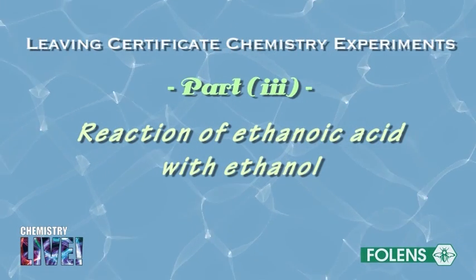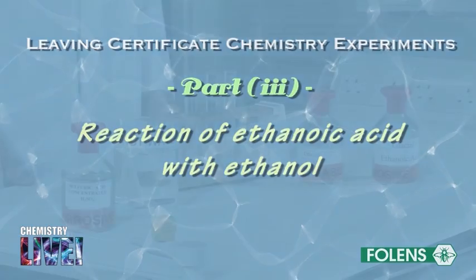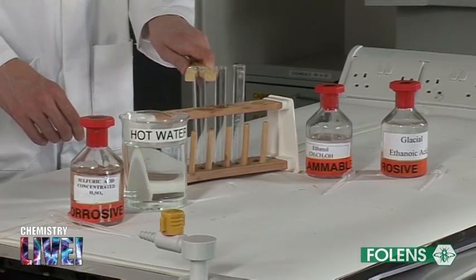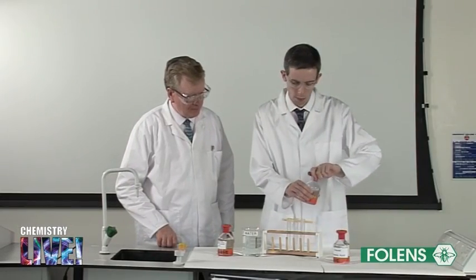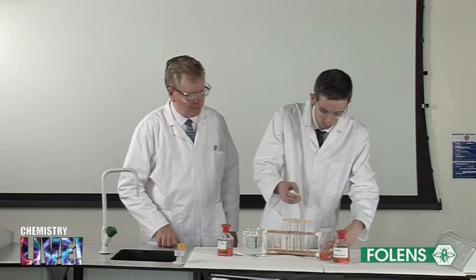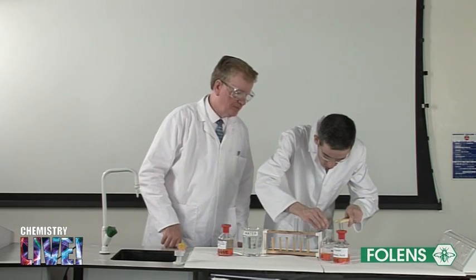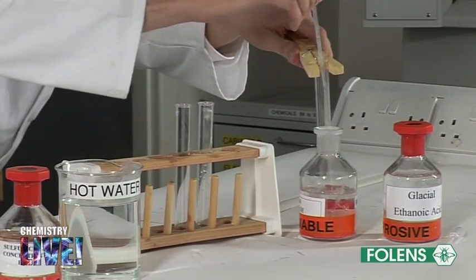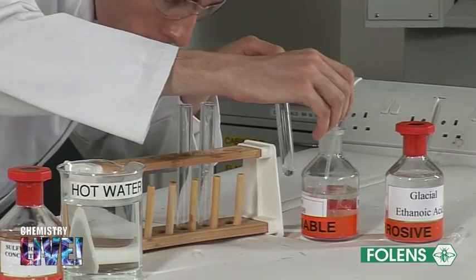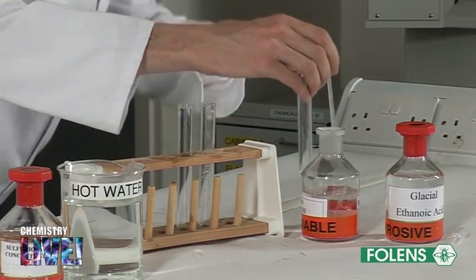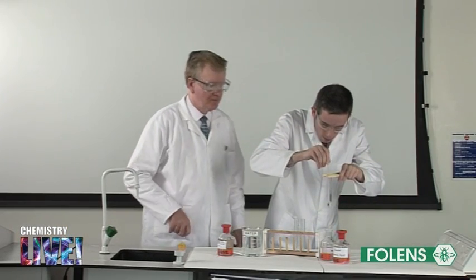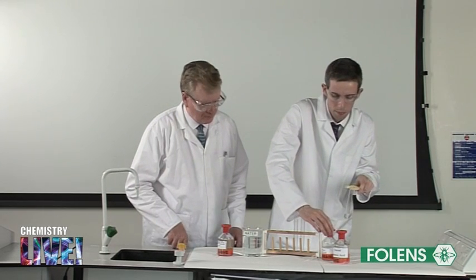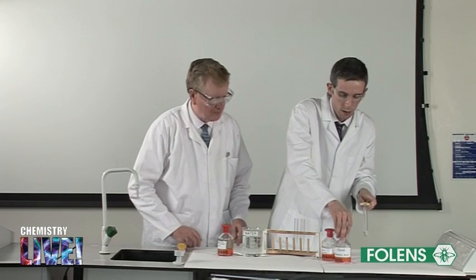We now investigate the reaction of ethanoic acid with ethanol. Mix 2cm cubed of ethanol and 1cm cubed of glacial ethanoic acid in a test tube.